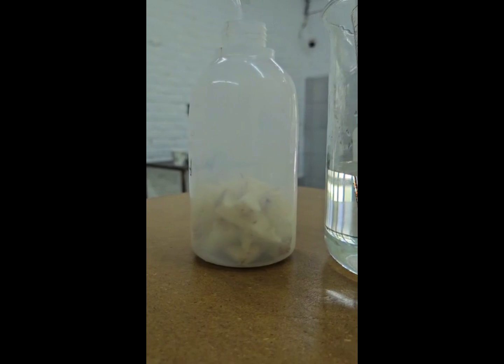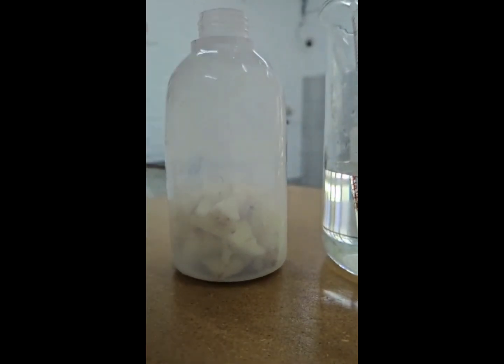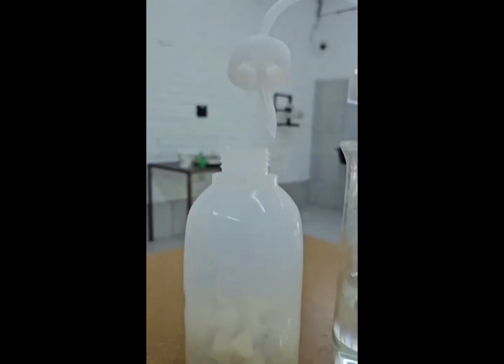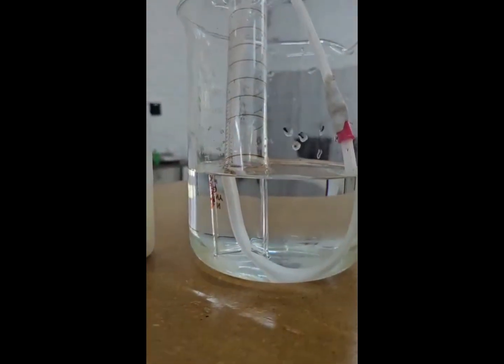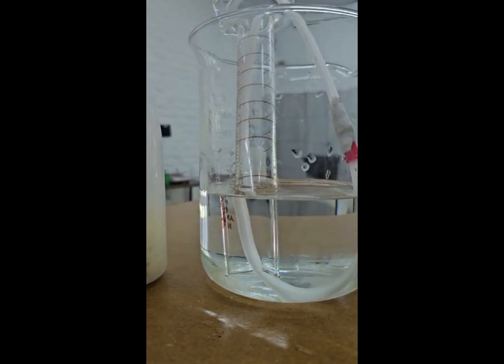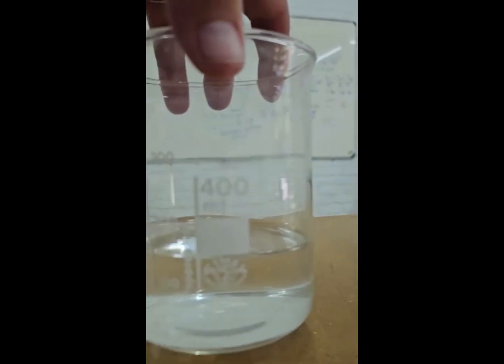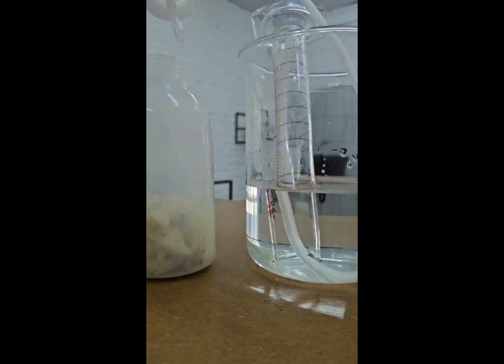In this experiment, what I did is I took some potato, and potato has some catalase in it. I then put the potato inside a container that could seal, connected to a tube with an inverted measuring cylinder. I then have a solution of hydrogen peroxide. It's very important in this reaction to keep the pH very constant.